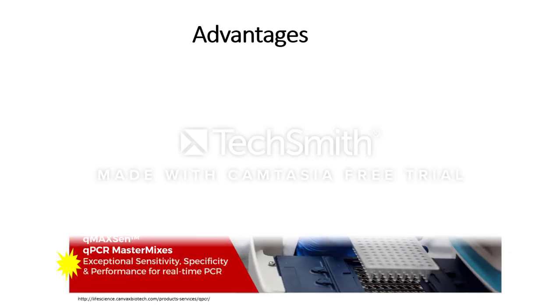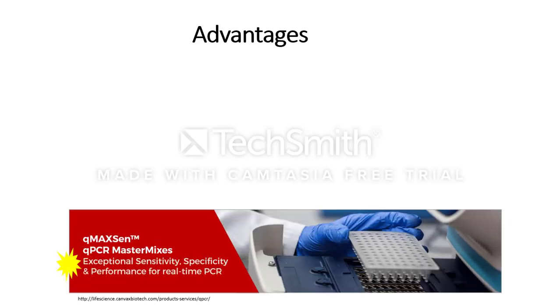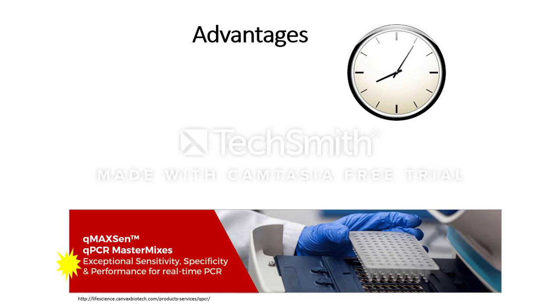What are the advantages of using qPCR? This technique has improved precision in the quantification of target sequences. It is capable of measuring the initial concentration of target DNA over a vast dynamic range and with a high degree of sensitivity. As little as one copy of template DNA is initially needed. It allows for the ability to process many samples at the same time. This technique increases the overall speed of gene expression analysis.